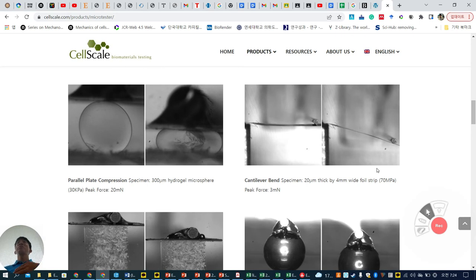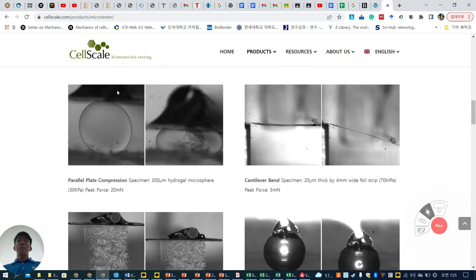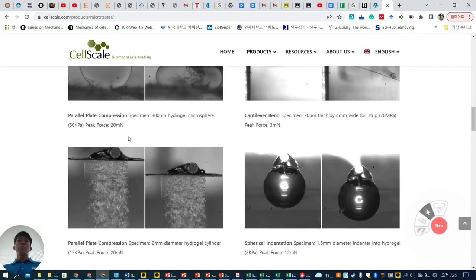걔네가 뉴턴 값도 나오고, 에어리언도 정해져 있으니까 아마 뉴턴 값으로 나올 거예요. 근데 파스칼로 변환하려면 면적을 아니까 계산할 수도 있고요. 크기가 하여튼 수백 마이크로미터예요. 지금 스페로이드 같은 게 100 마이크로인데, 한 3분의 1 되는 크기라 조금 작은 감은 있지만 그래도 가능하겠네.